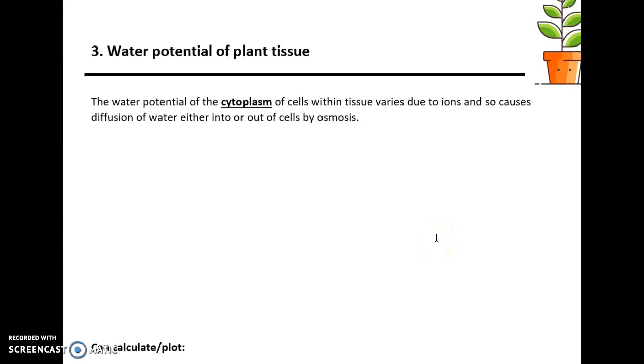Hello and welcome to TeachingBio. Today we're going to look at the third required practical for AQA A-level biology, and that is the determination of the water potential of plant tissue.